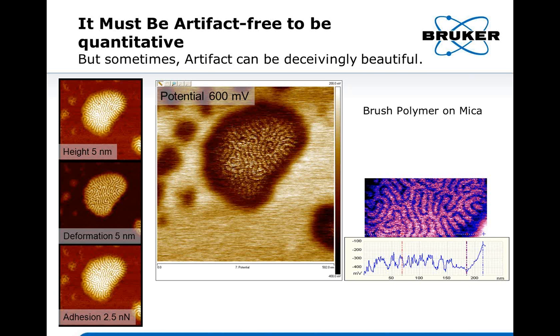We fix the frequency. Basically, we drive the Kelvin piezo to cause the tip to resonate at its resonance frequency, and fix the frequency. Then we apply AC bias to induce a modulated electrical force gradient and to cause the frequency to change.